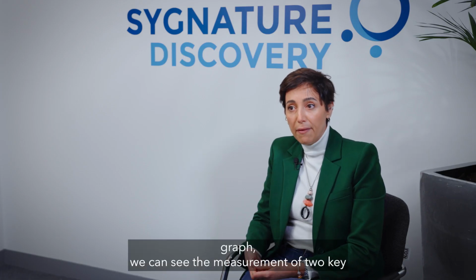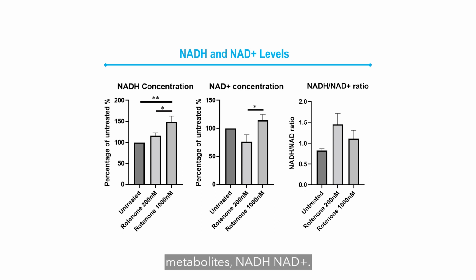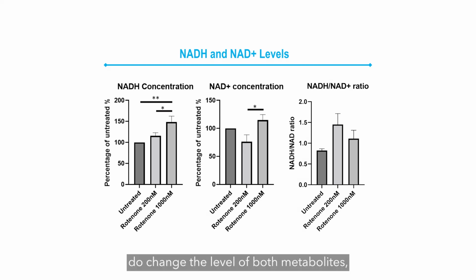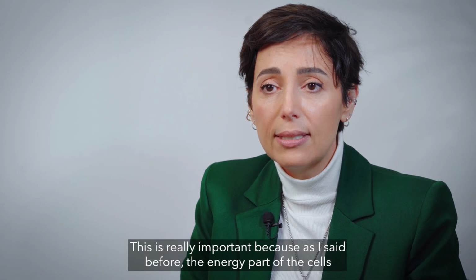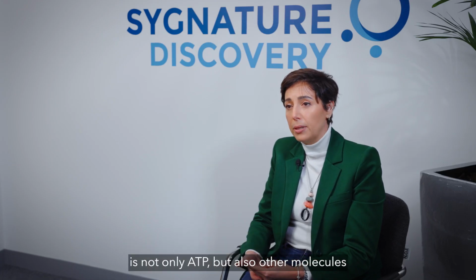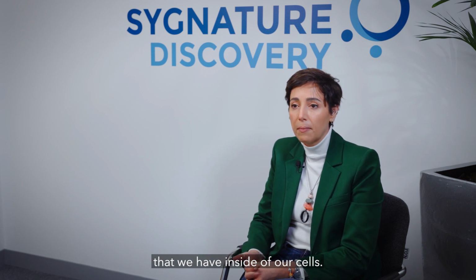In this next graph, we can see the measurement of two other key metabolites, NADH and NAD+. We can see again that the neuroblastoma cell line treated with rotenone, again at two different concentrations, changes the level of both metabolites. And the ratio of NADH and NAD also changes. This is really important because, as I said before, the energy part of the cells is not only ATP, but also other molecules that we have inside of our cells.